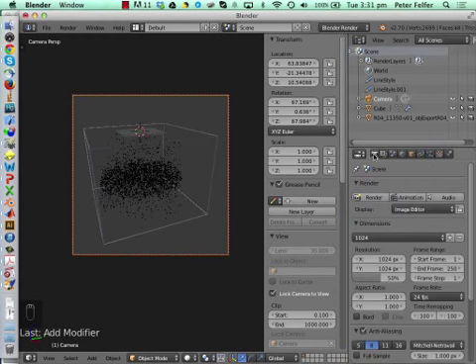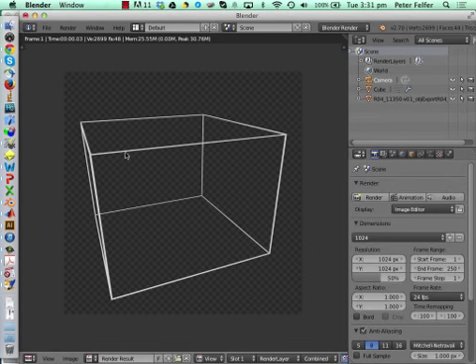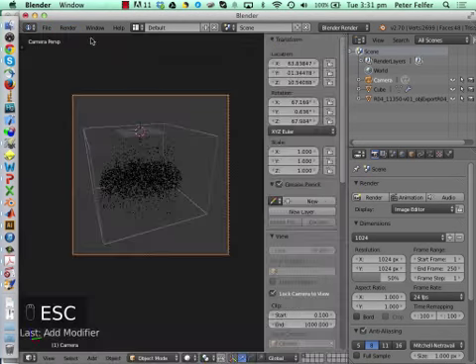And here we go. If I render it now, you'll see we've got the wireframe here. I'm sorry, I've still got Freestyle on. That's why we get the lines here. I'll just switch Freestyle off. We've got the wireframe, and of course it didn't render any of the atoms that we actually want to render. Oh no, it doesn't. Okay, never tried that before.